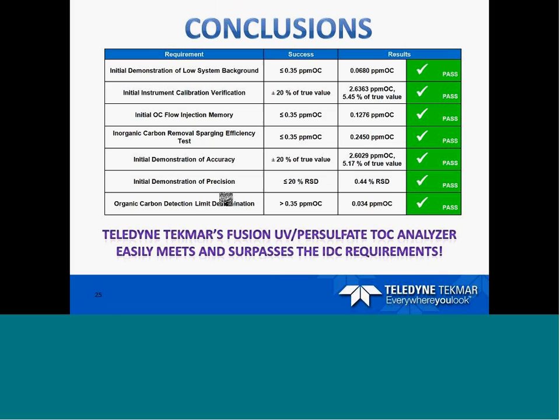So all of these look at the overall method. We primarily looked at all the major parts of the initial demonstration of capability. Now, we usually have to run the IDC when you're changing over to new analysts. It's not something that most people have to run all the time, but it really does give an overall view of how the instrument is running as well. So we met all of our IDC requirements, and you run these prior to running samples.